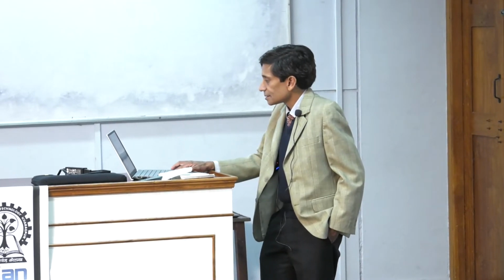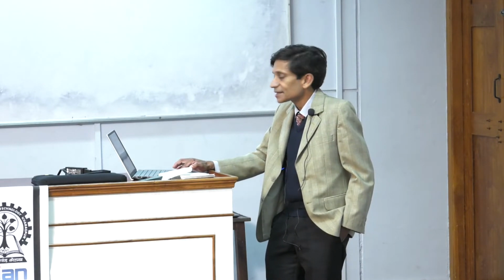So getting back to our figure here, I've talked a little bit about this depth filtration, and actually I should have switched, never mind, I'll switch the pointer for tomorrow. So depth filtration comes here just before we move into the capture step.